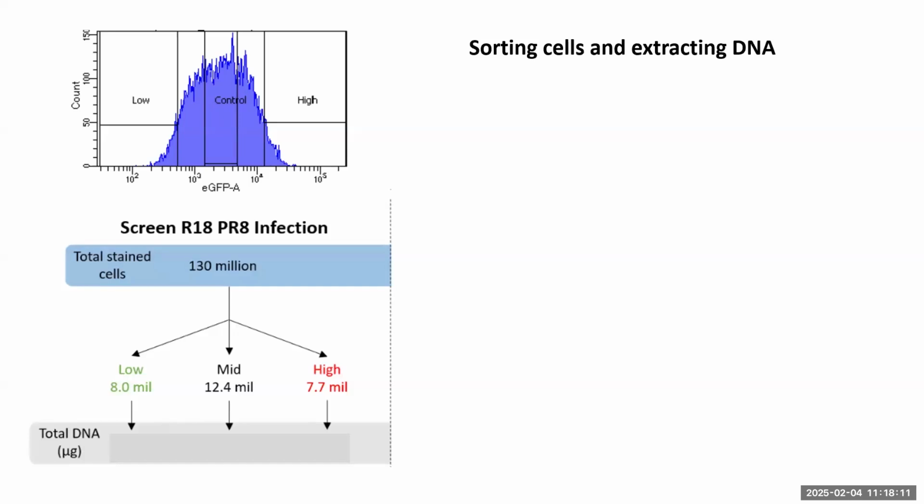You want to get this aspect of it really well optimized. For example, we've got screens where we've done influenza virus, or IBV, or IBDV. Then we've got screens like the xenotransplantation one, and each of them are really quite different, and you have to do that optimization to get it to really work well. Okay.